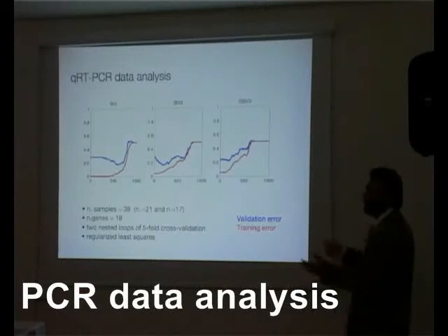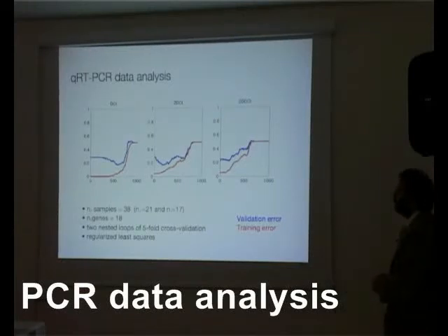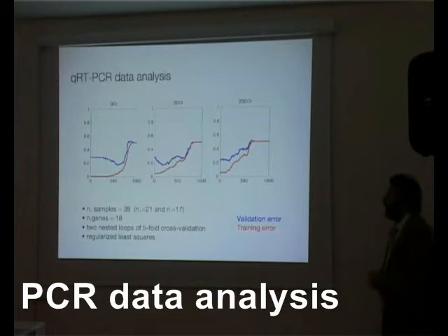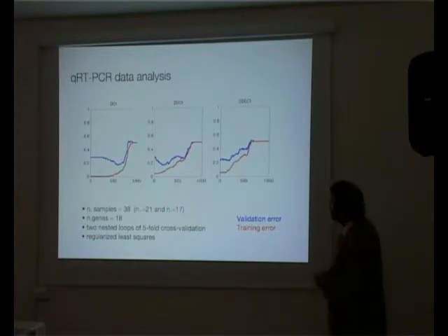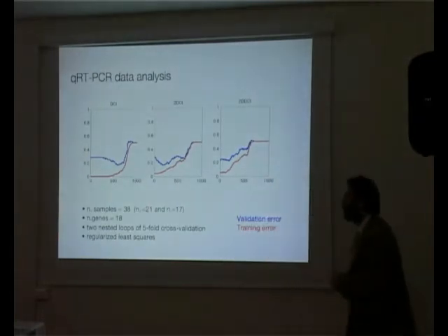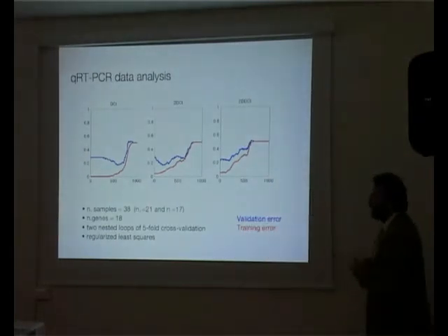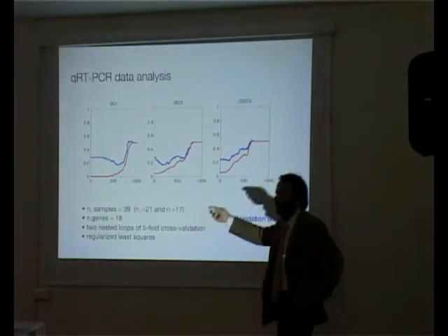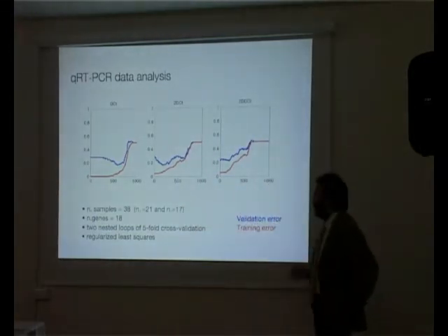Anyway, so now we're at the most exciting part, in my view: we're getting the real-time PCR, which we could think of as the "let's see whether what we got made some sense or not." And so we were given 3 different data sets coming in with 3 different normalizations, and we don't know exactly which one to use. So this is an interesting thing because this is something you could find in a machine learning textbook.